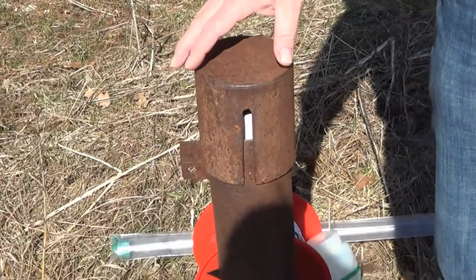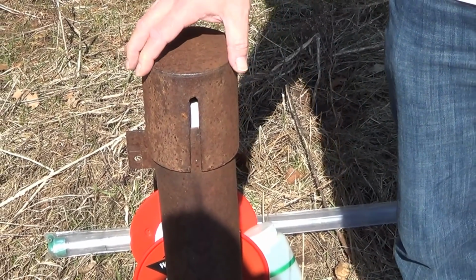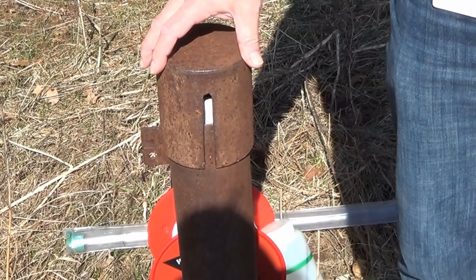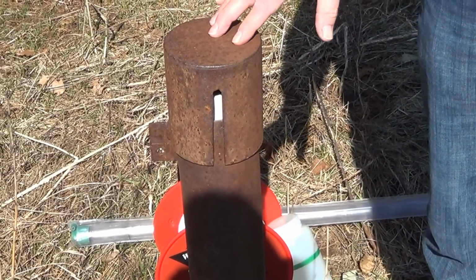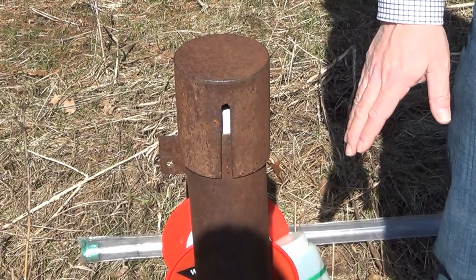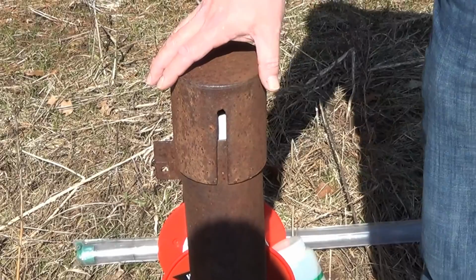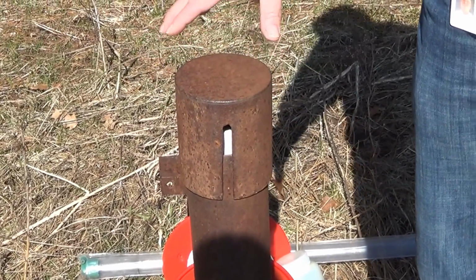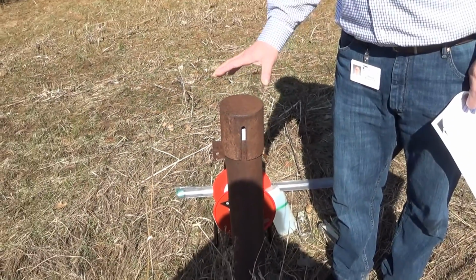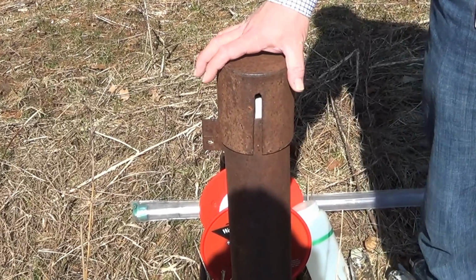Here we are, we're at UWGB. They have several groundwater monitoring wells. And today we're going to demonstrate how to measure down to determine what the level of the groundwater table is at this site. As well, then we're going to bale the well in preparation of recovering a sample, a groundwater sample.